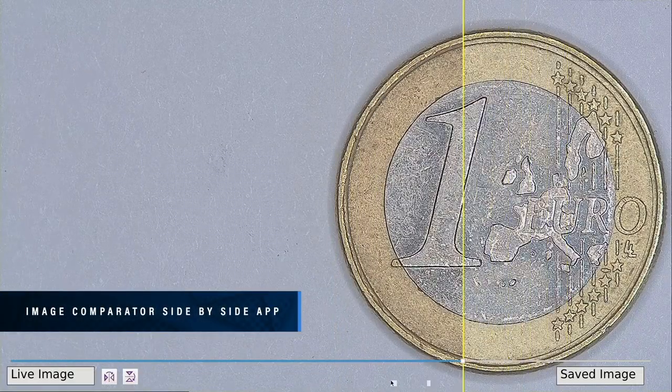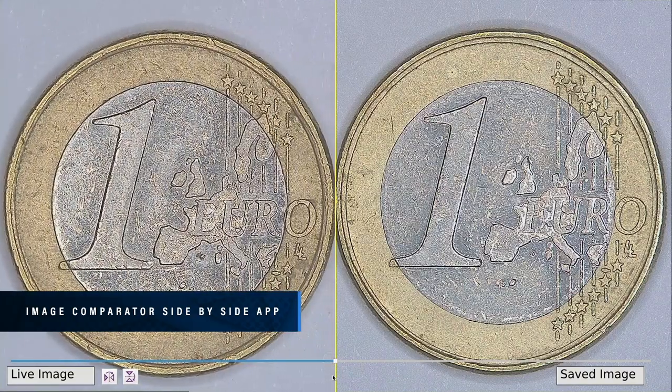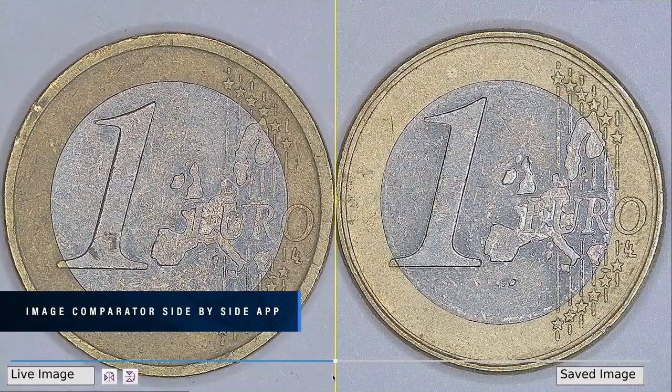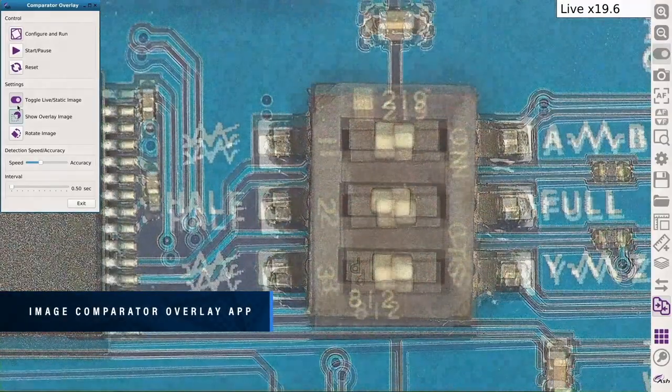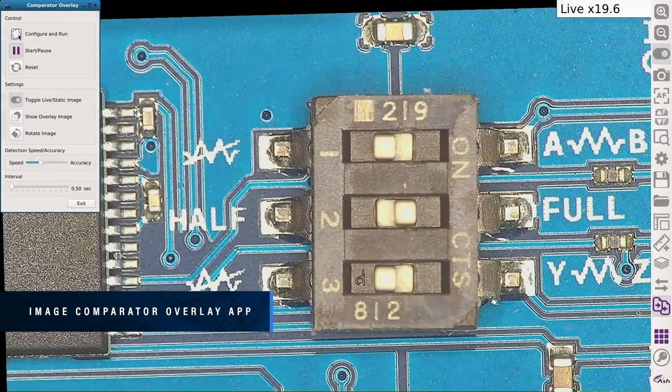Compare live images to a stored golden image on a split screen to eliminate human error and increase throughput for rapid fault detection. Identify defects by alternating between live and master images, and quickly identify the differences between gold and test samples. Remove the need for a costly jig with the power of automatic alignment.